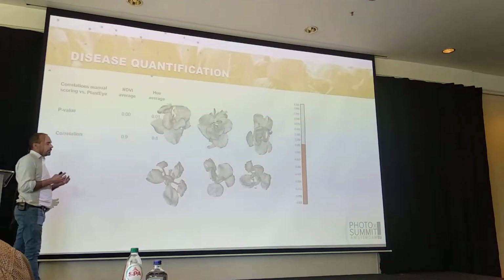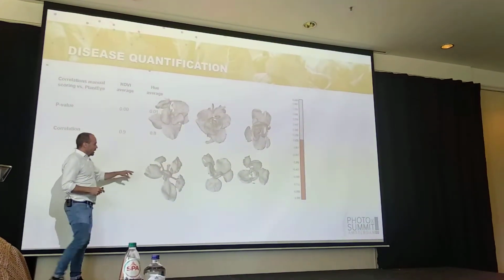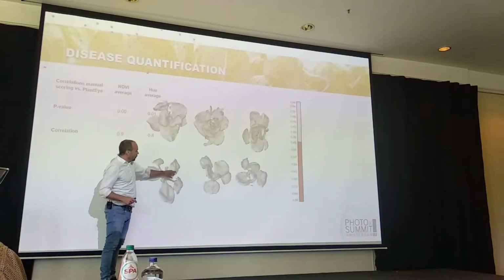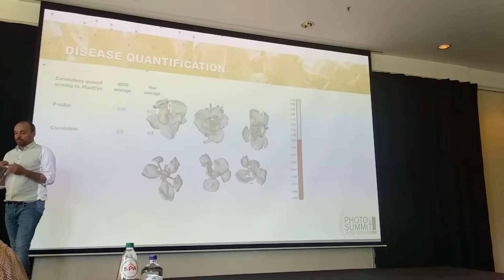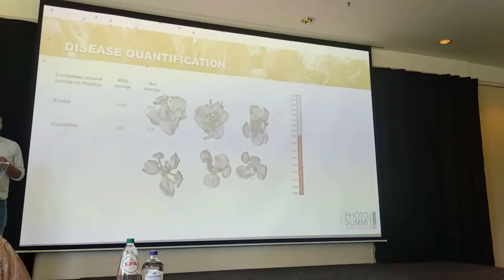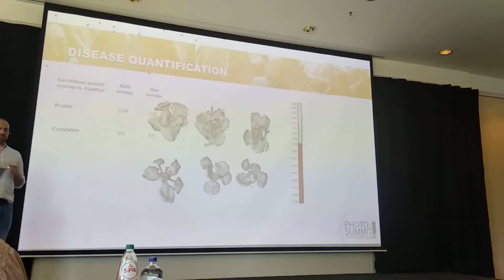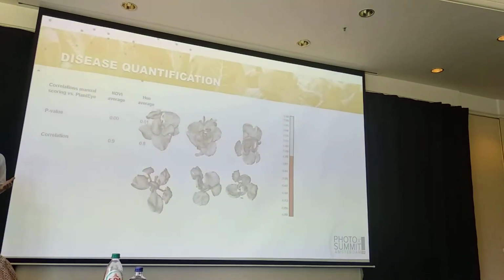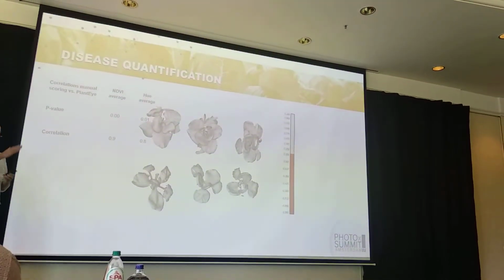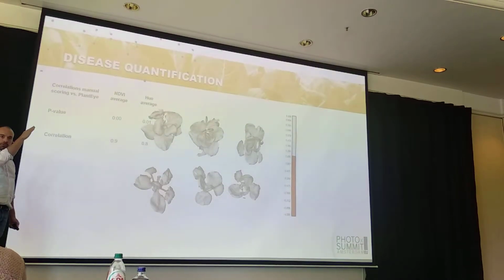Here we use some spectrum which we can't see with human eyes, and we can discover all the regions which are affected by the disease, and we can quantify that, really give a number. It's not something like I give it a 5 or maybe a 6 out of 10, it's a real number. And this number is also corrected for perspective, because we have 3D information. So we don't care whether the leaf is like that or like that, we can correct for this, right?